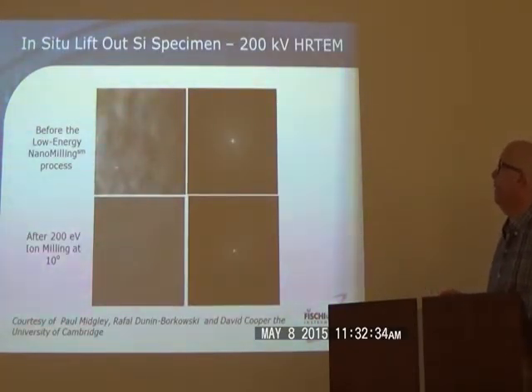Silicon, what can you expect? After the focused ion beam process, often we see bigger splotches. We don't see the little splotches, we see larger splotches, but they're also due to the focused ion beam process. Basically, that's coming from a bowl full of jelly that's distorting the image. This little diagram here is called a fast Fourier transform, and you don't even have to remember that after you leave.